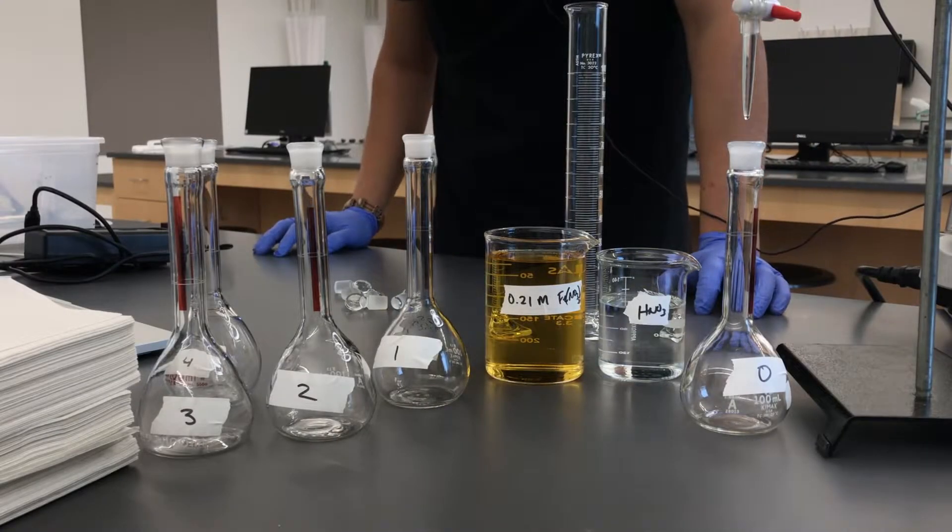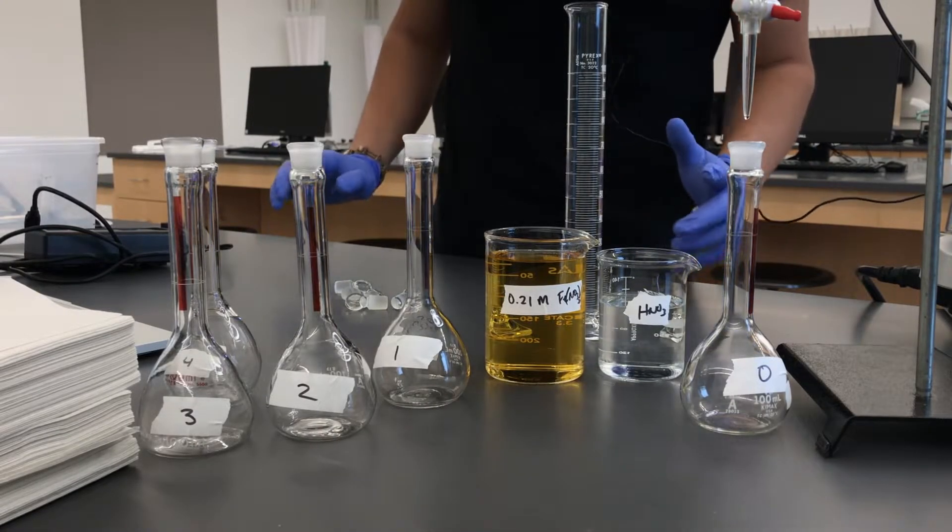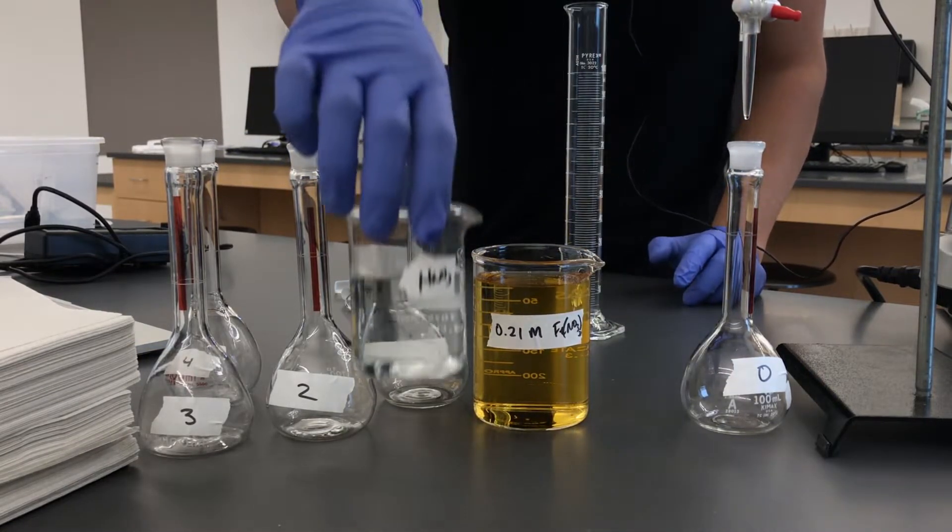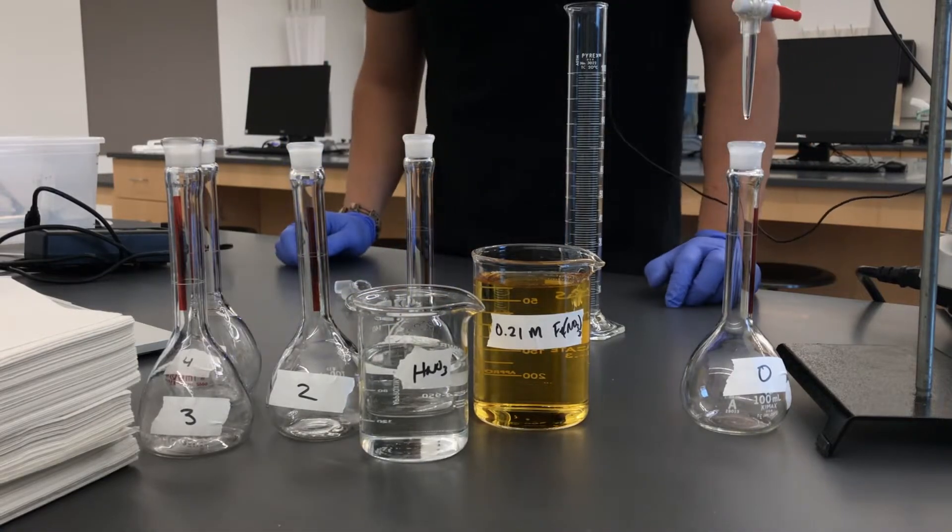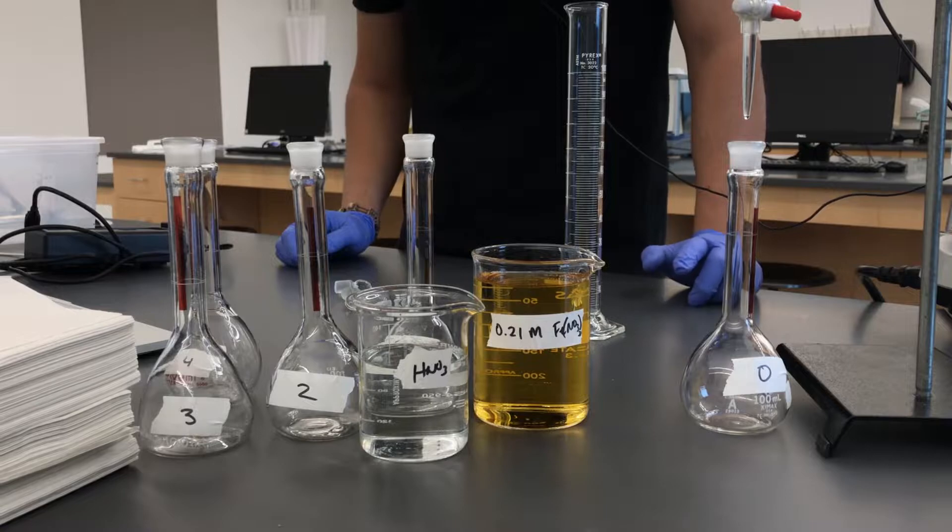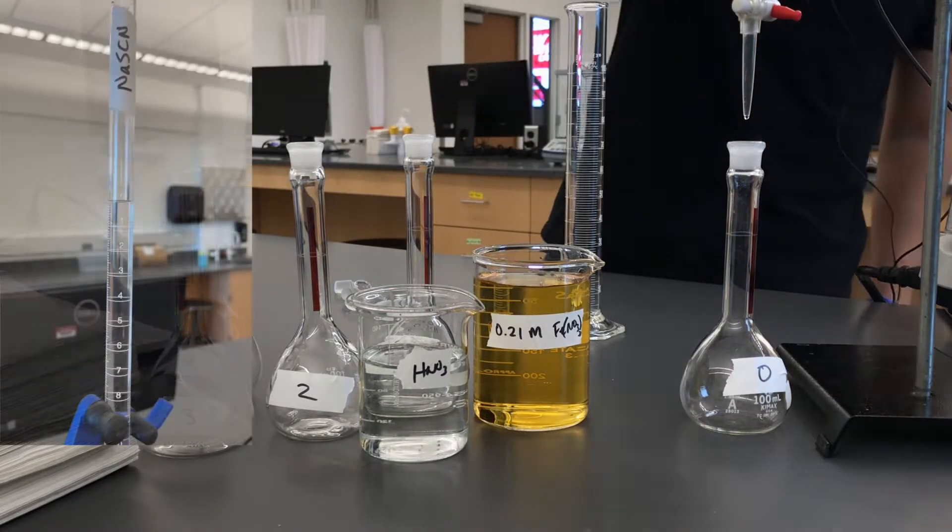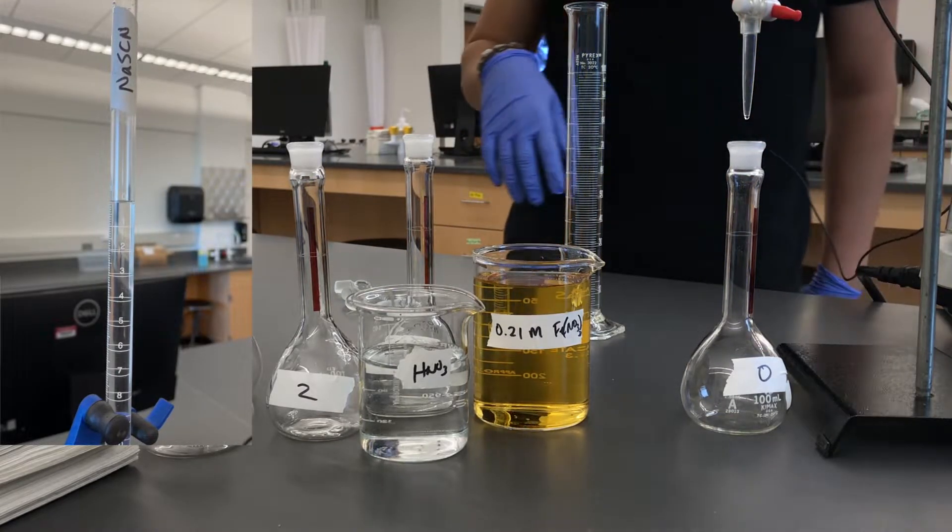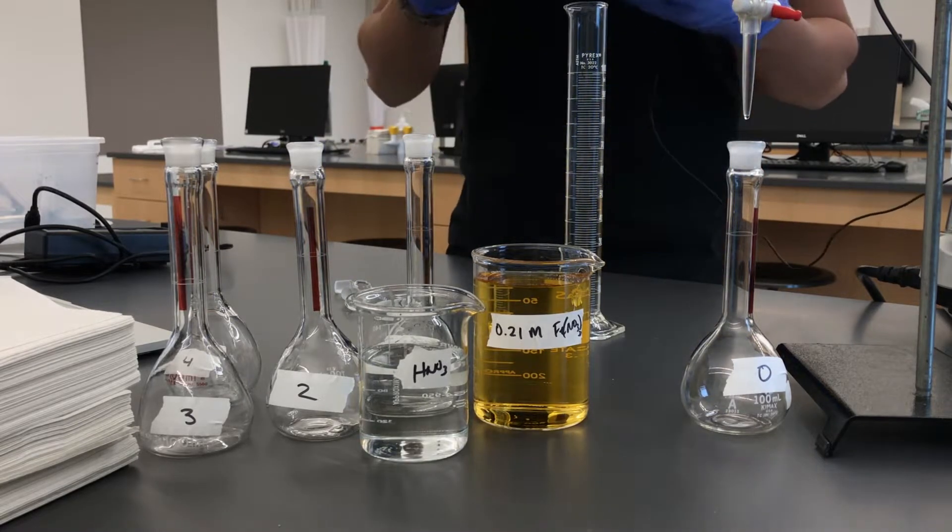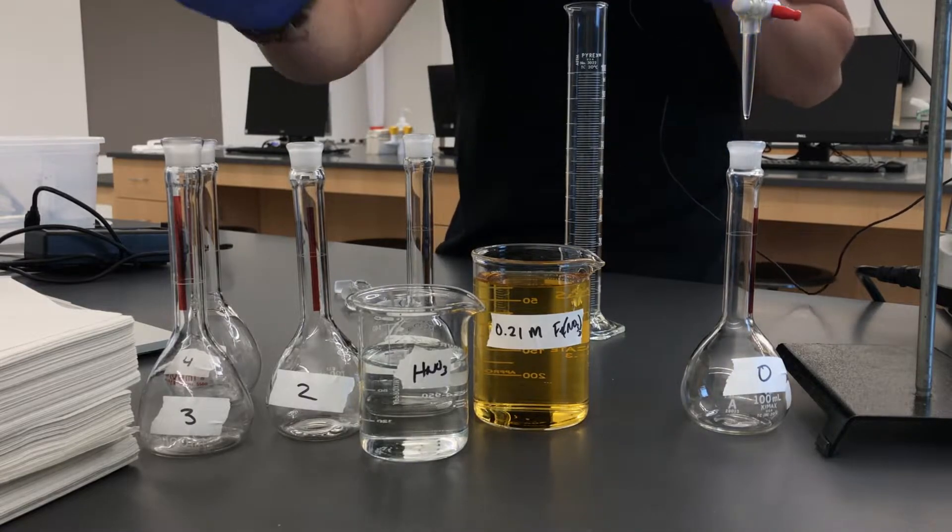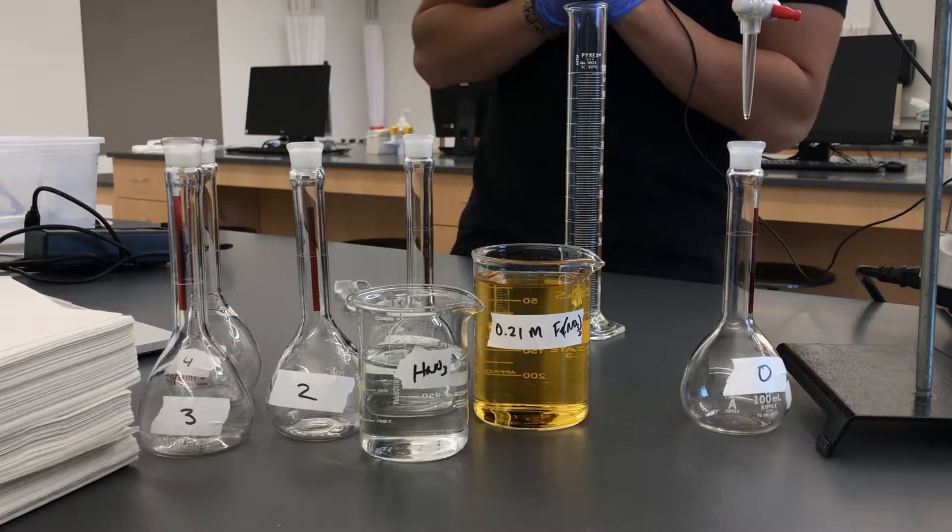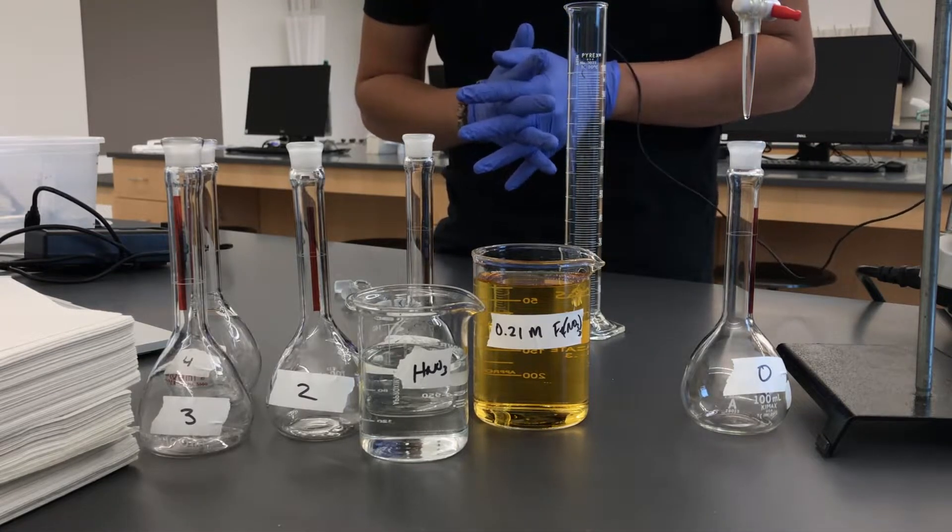To set up our experiment, we have some of the more concentrated ferric nitrate in a labeled beaker, as well as some nitric acid. And then finally we've got some sodium thiocyanate in the buret which is all set up here on the ring stand. We also have some clean, dry volumetric flasks, five of them labeled 0 through 4. These are the ones that we're going to use to make our standard solutions to make our Beer's Law plot.